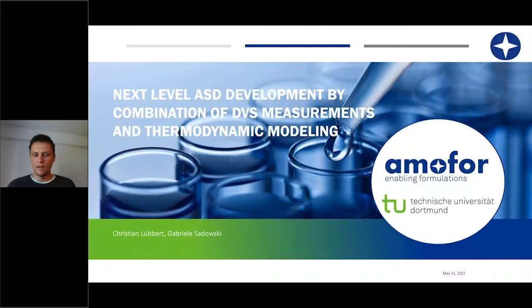Thanks for giving me the opportunity to talk with you today about the topic shown here and introduce you to next level ASD development by combination of DVS measurements together with thermodynamic modeling. What can be achieved if we combine these 2 applications in the development of pharmaceutical formulations? It's a great pleasure that I have this opportunity now to share this with you. So good afternoon, good morning to all of you.